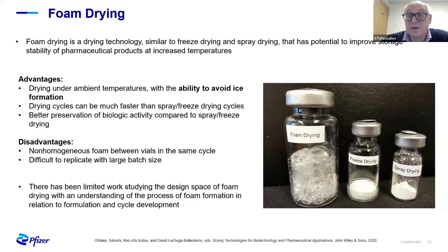What you can also do is dry very fast. By foaming, you create a lot of evaporation surface, and if you consider it primary drying, because it's never frozen, the initial evaporation step is very fast. Once you remove the majority of the water, you start to remove moisture during secondary drying. Even with that, it takes longer than normal secondary drying, but it's still a short process.